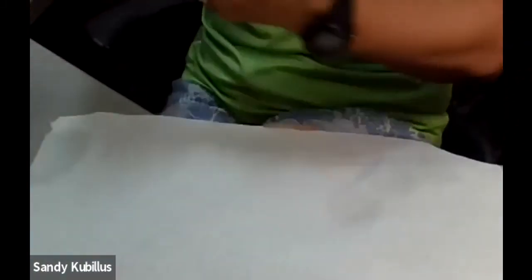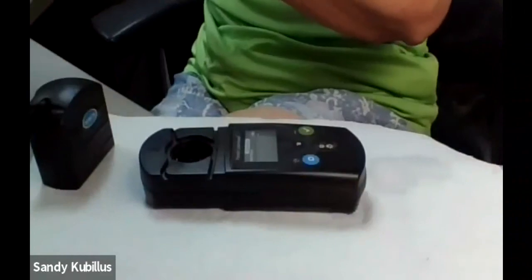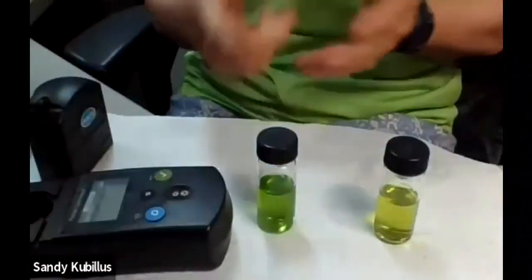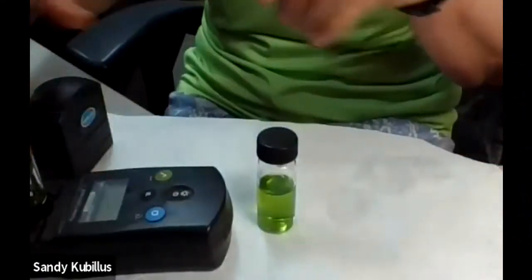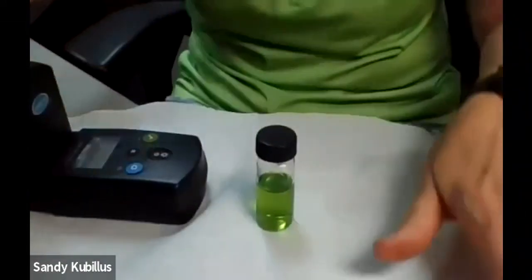That's something similar for ammonia nitrogen. And notice we had two different colors here. We have a greenish color. Let me get that where you can see it over the white. And that was the higher sample. That was the Des Plaines River, and this was Willow Lake. And again, you would put these samples in here, close it up, and read your sample as well.